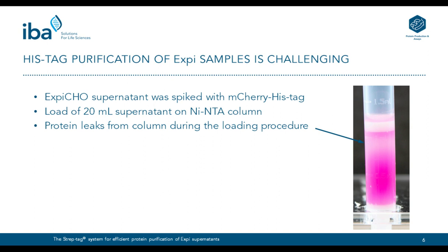And as you can see, during the loading procedure, the protein starts to leak from the column, indicated by the white area in the upper part of the column. So it seems that there are some substances in the media that interfere with the HIS tag binding, and obviously this is not the most efficient way to purify your protein from the supernatant.